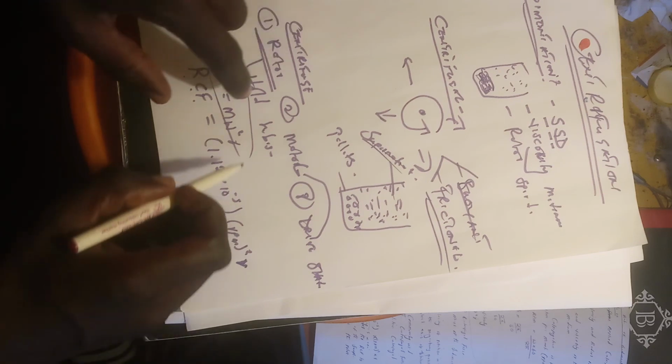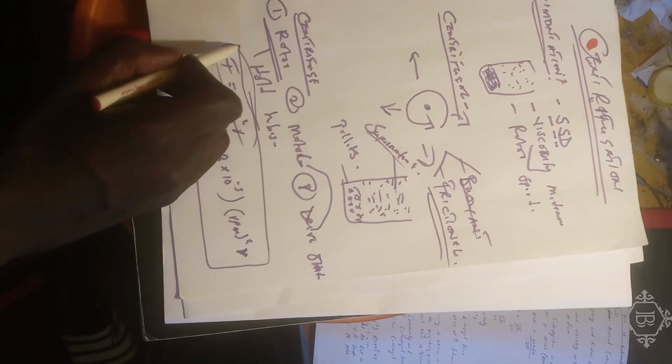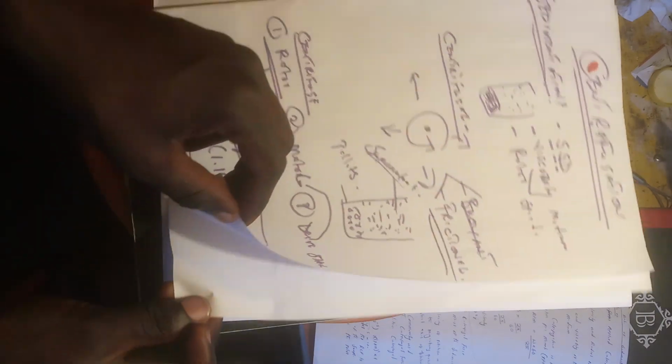But I would love to make a video tutorial and explain how we can derive these formulas, and maybe look at one or two calculations and try and help each other. Another thing, the second part I would love us to look at is the types of rotors.